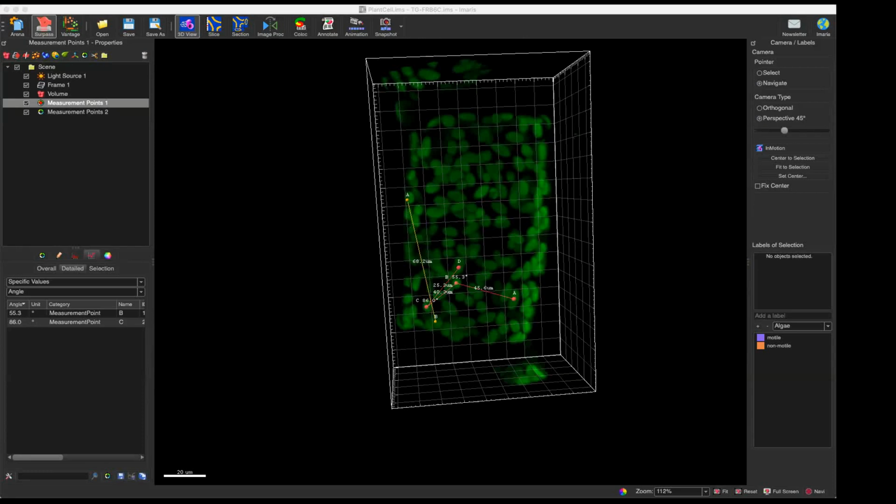So in Imaris, we provide different tools for the segmentation of different applications. The basic two are spot and surface, which are also very powerful. The more advanced ones for specific applications are cells and filaments, which hopefully we will talk about in later or future training sessions. Today we focus on spot and surface and the basic part.